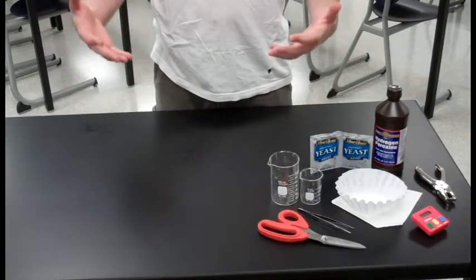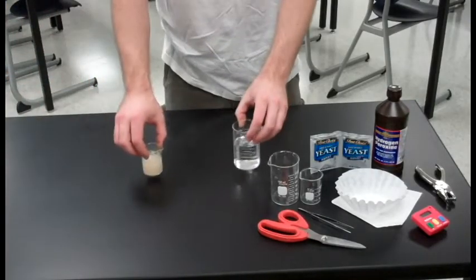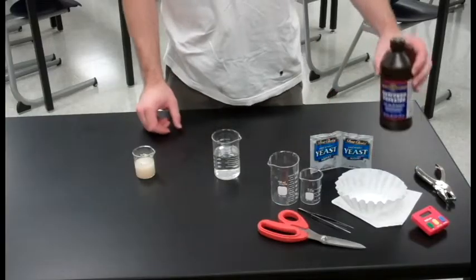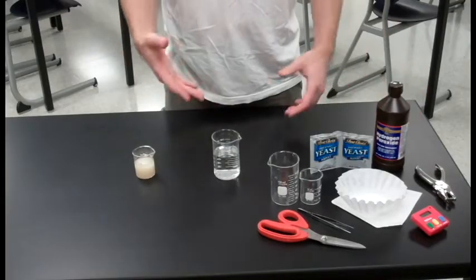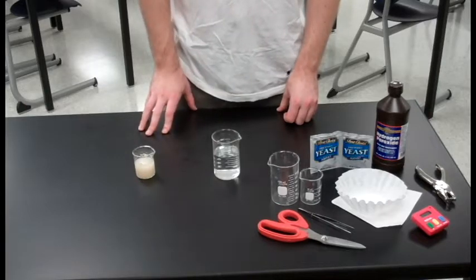The first thing we're going to need to do is set up two solutions. The first solution is going to be your hydrogen peroxide. Hydrogen peroxide is sold at 3% in any general store or grocery store. You can then dilute that down to any preferred percentage. This particular sample is 1.5%.